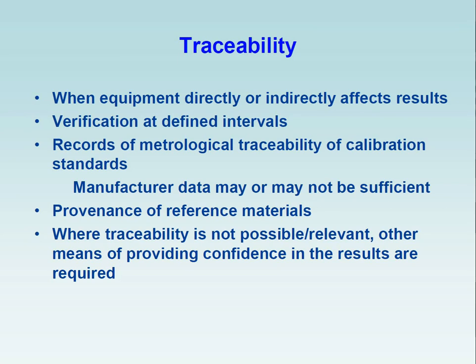Records and metrological traceability of calibration standards. So this is a little bit of a thorn, but take the example of your pipettes. The accurate calibration of a pipette is essential for you to perform and produce a valid result. And most labs, some labs, will not do that themselves. They will get some commercial organisation to come in and do it. Okay, that's fine. They give you a certificate and say it's calibrated. But you need to know the full metrological traceability. So you need to know what that company is calibrating, whatever they've tested your pipettes with. So what is the primary source? And they need to have all of that. You need to have that documentation from them.